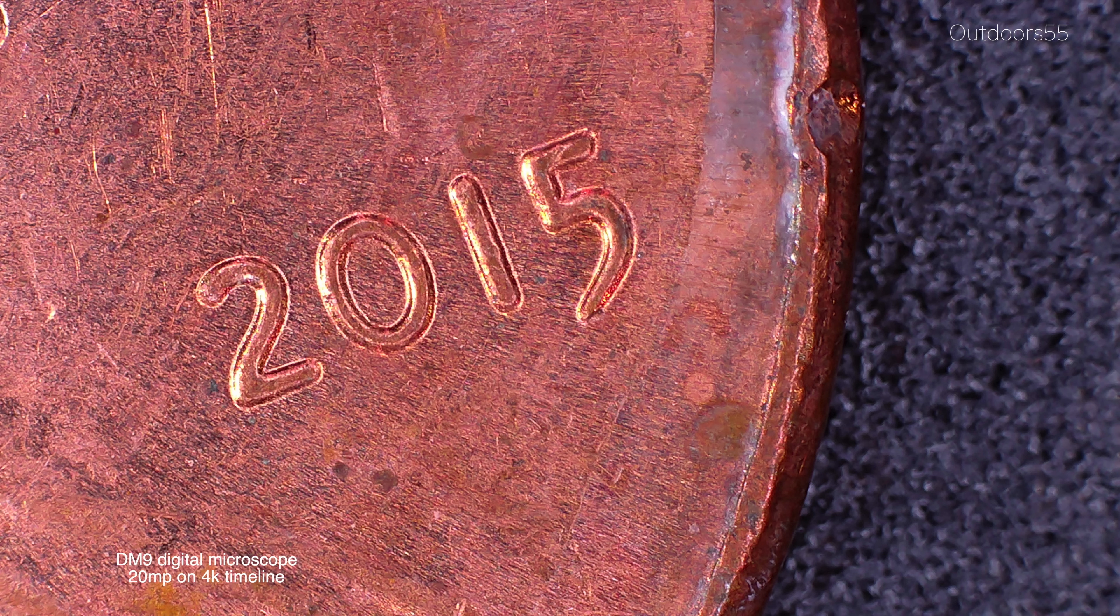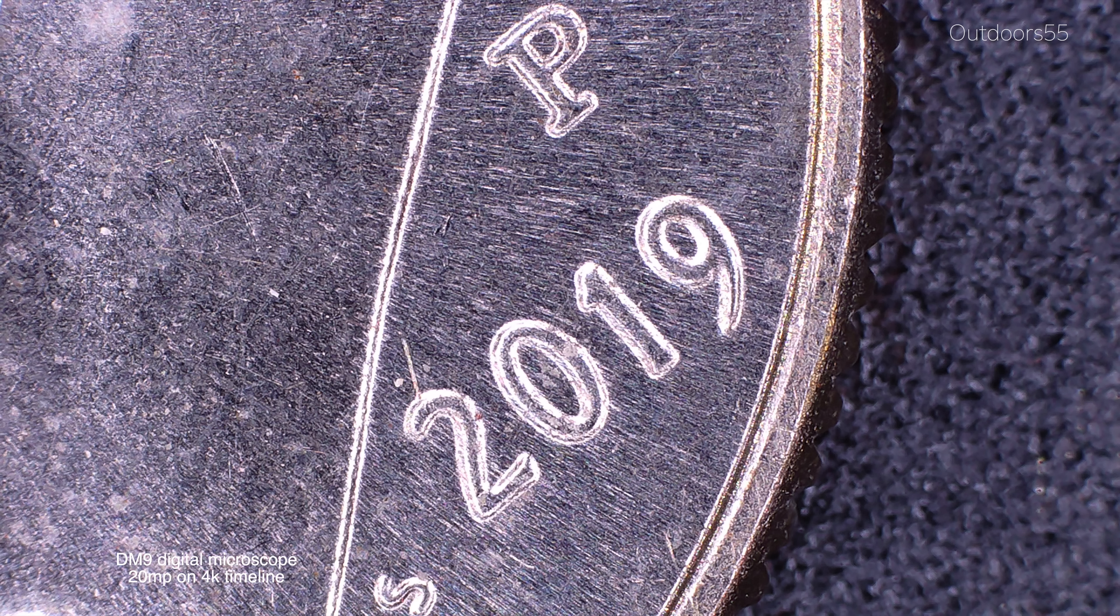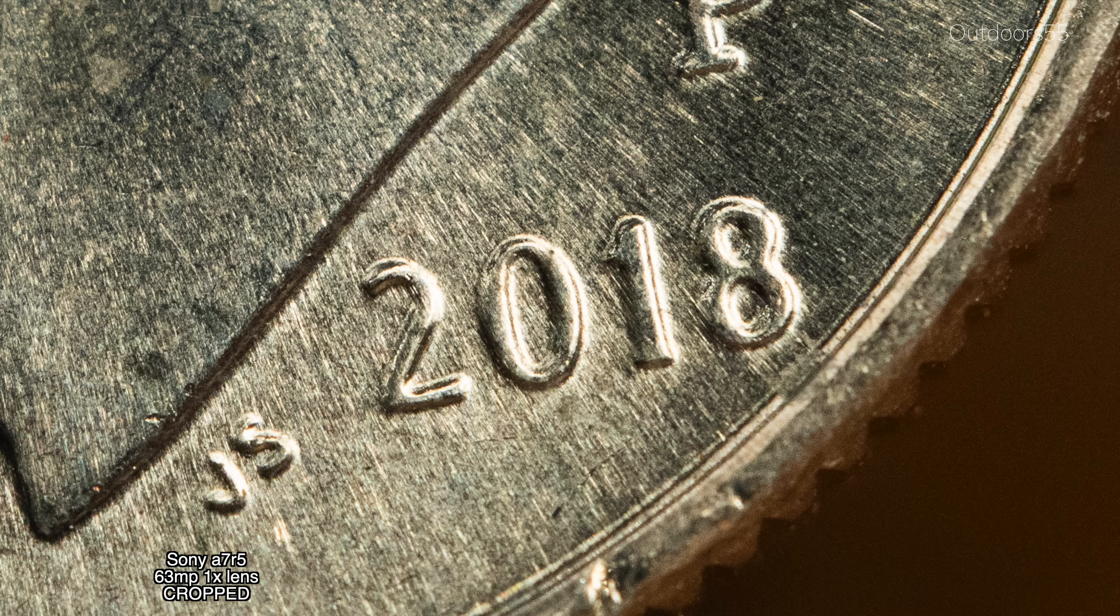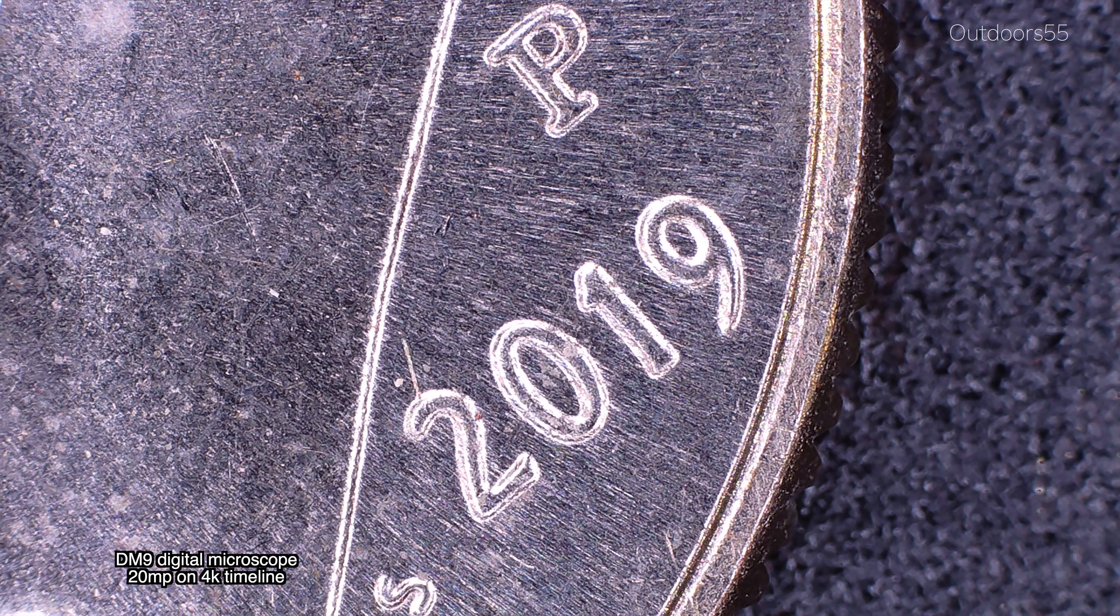So here's a couple of other things to give you an idea on the magnification you can get out of this cheap digital microscope. Here's the date on a penny and the date on a dime. Now again, keep in mind this is a 20 megapixel uncropped image that you're probably viewing in 1080p or 4k and we can get closer by cropping in, but in a comparison this is a Sony a7r5 with a simple 1X macro lens and you can see that when we crop in the quality out of this simple 1X macro lens versus the cheap digital microscope is still better.